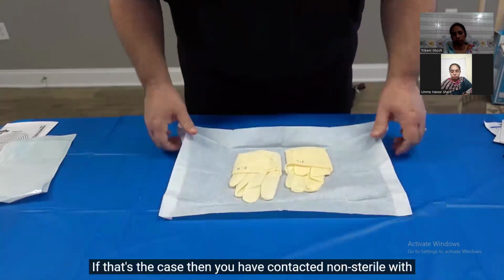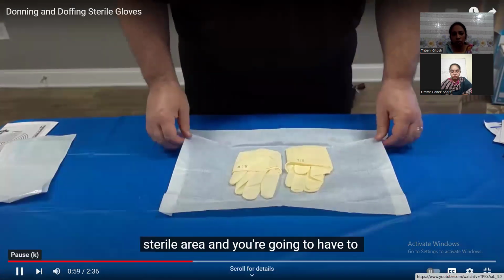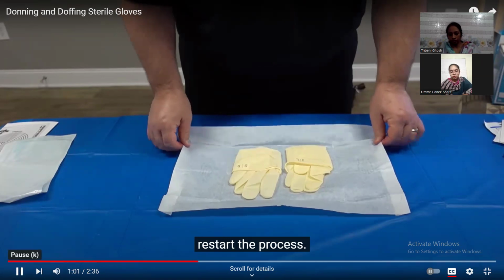If that happens, you've contacted non-sterile and sterile areas, and you're going to have to restart. We can skip that part because when we work in the lab, we have a whole bunch of gloves, and we take the gloves from there. What we do is first sanitize our hand with hand sanitizer, so you can skip this step of the process.